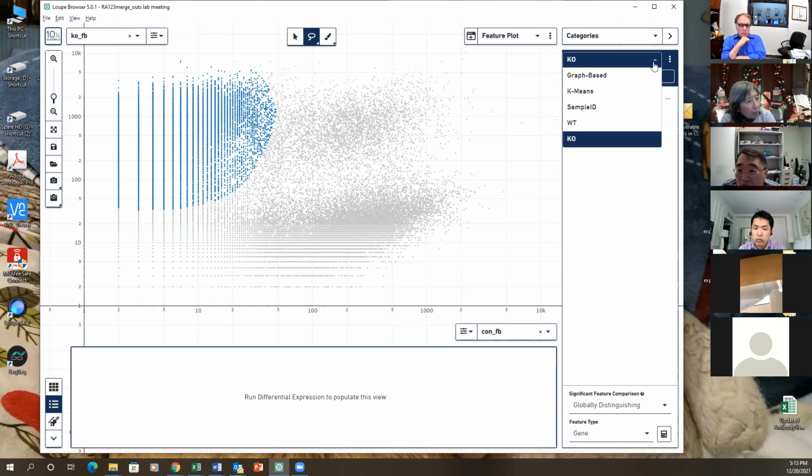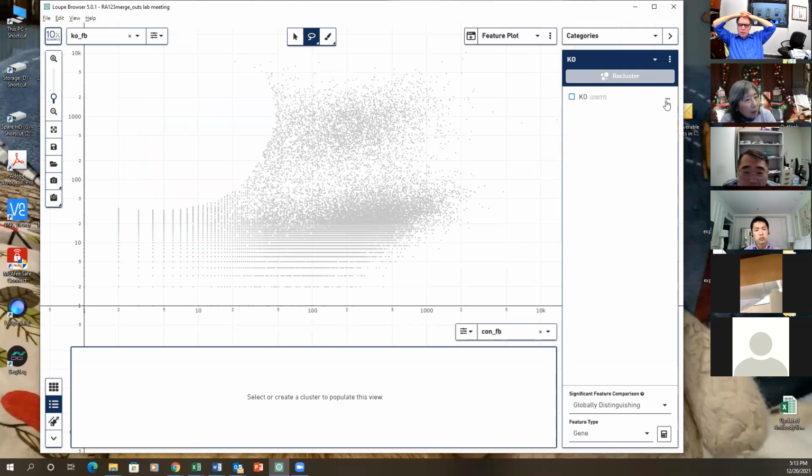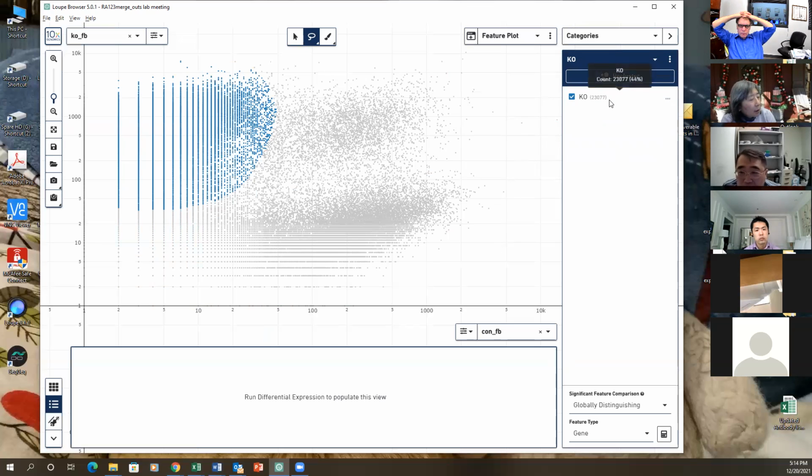You cannot separate into two different groups. Right now, you separate into WT and knockout. That's two big groups. You just cannot compare them together. You have to put all of them together into one big group, so you can compare them later. But they're already in one big group here. We're trying to get them into groups. Yeah, you can. You need to regate again. It doesn't matter because they are two different groups. You can keep them.